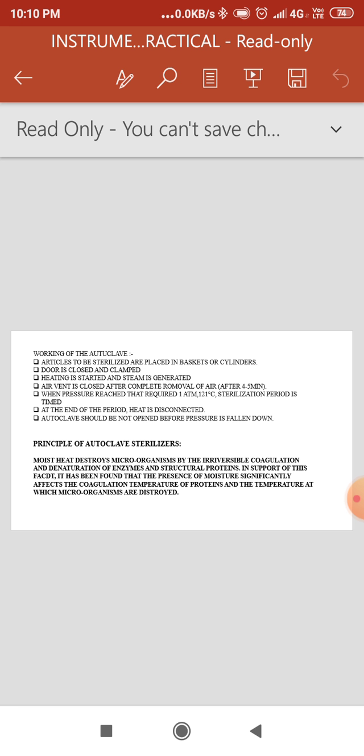But today we are going to see these practicals on the PPT also. So what are the applications? To sterilize culture media for identification and propagation of pure strains of microorganisms, to sterilize the various surgical stainless steel instruments that are required for moist heat sterilization, to sterilize the various types of surgical dressings, gauze, etc., and to sterilize applicators, equipment, solutions, syringes, etc.